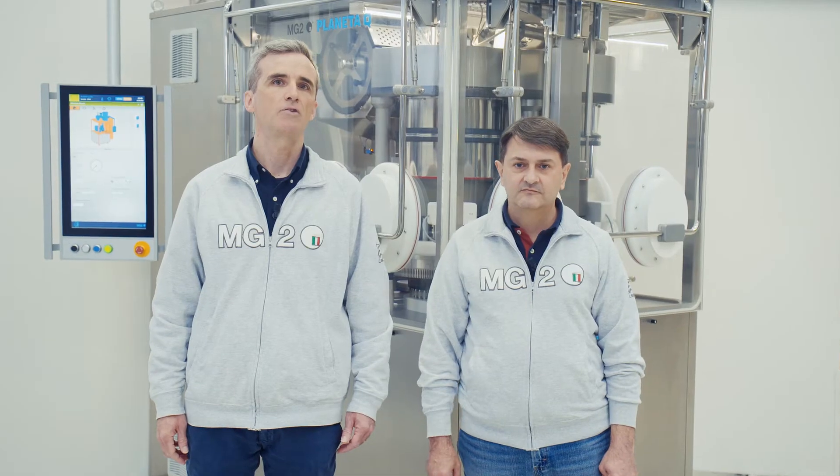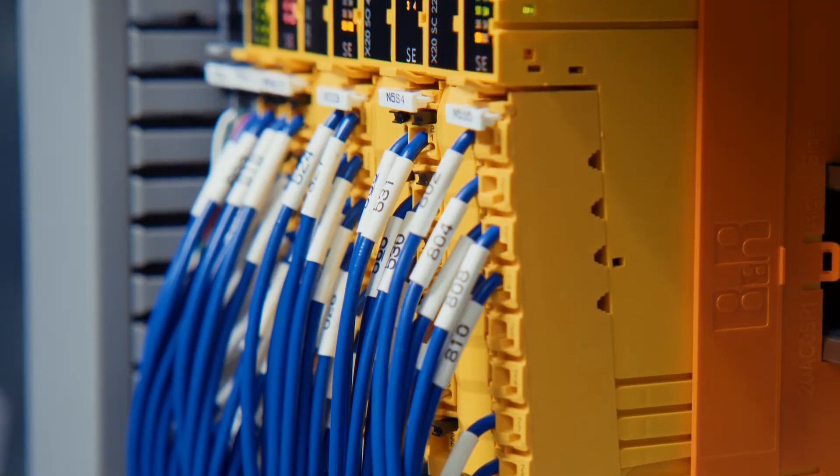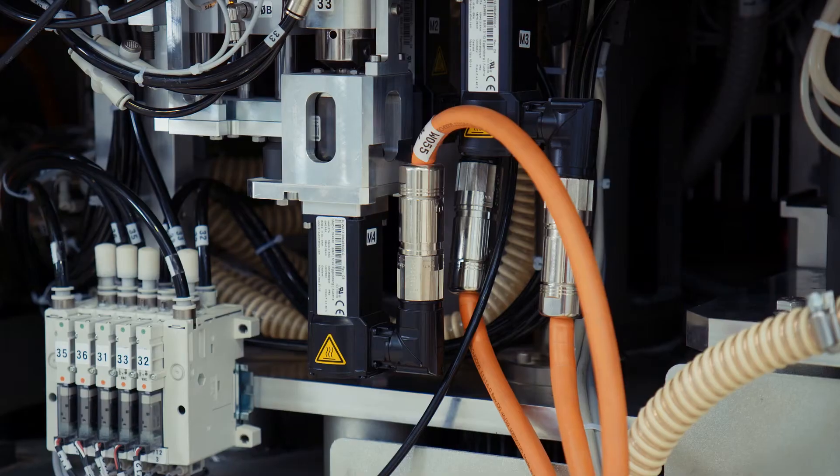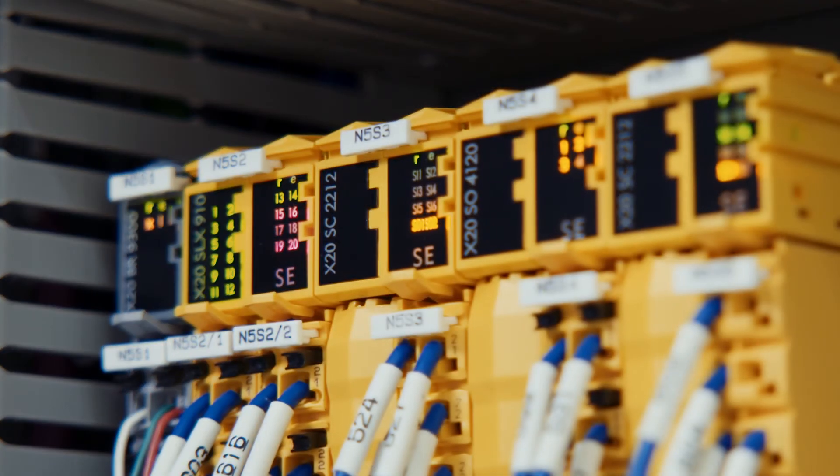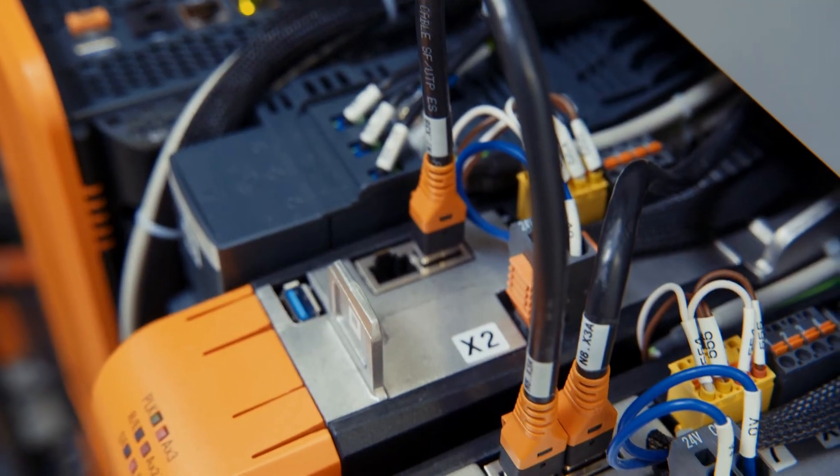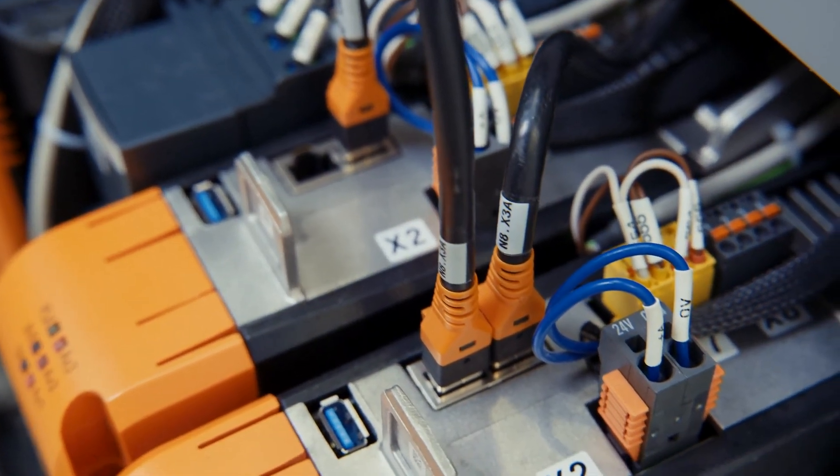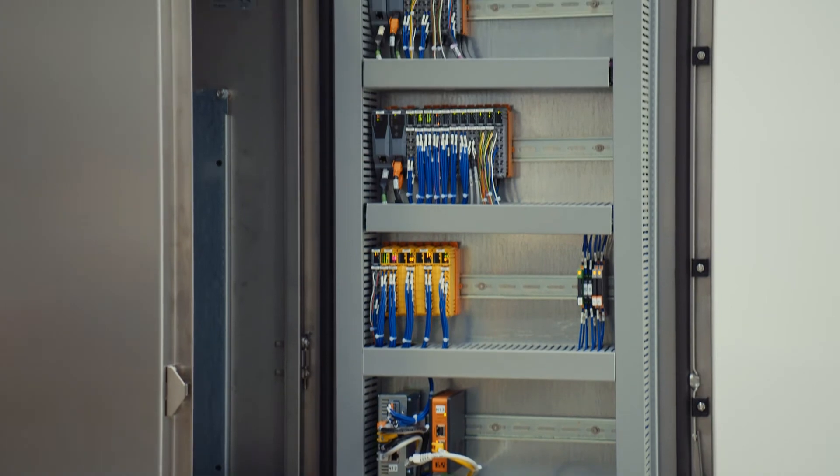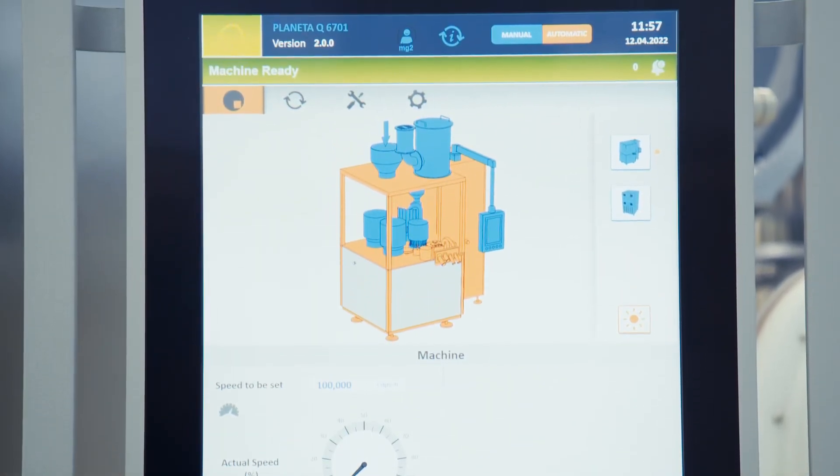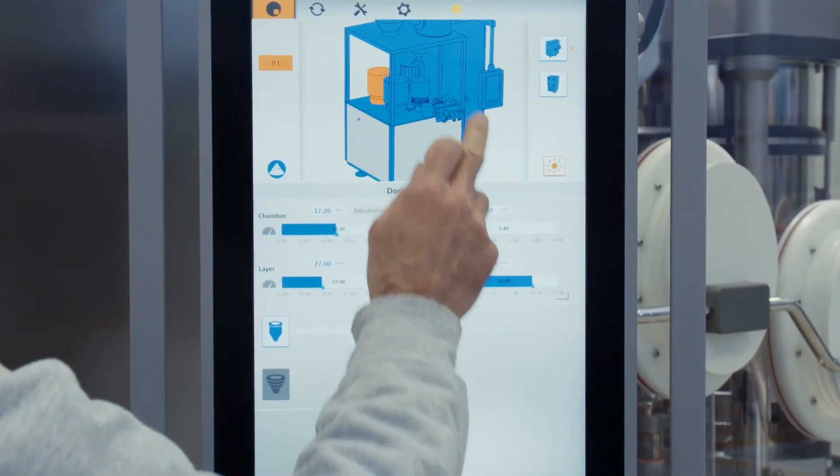Planeta Q automation is fully integrated thanks to B&R technology: Motion, Machine control, HMI interface, Weight control, Quality report 21 CFR Part 11, Production statistics, Industry 4.0 connectivity based on the industrial OPC UA in one unique B&R software platform, Automation Studio, using web-based HMI, MapView and Map Technology.